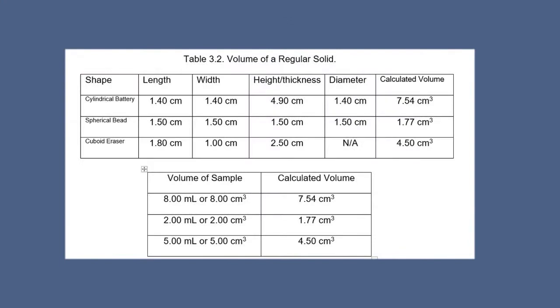Using a paperweight and a rock sample, we are able to calculate its volume by subtracting the initial volume the water occupies in the container from the final volume the water and sample occupy, in cubic centimeters, while following the correct number of significant figures.